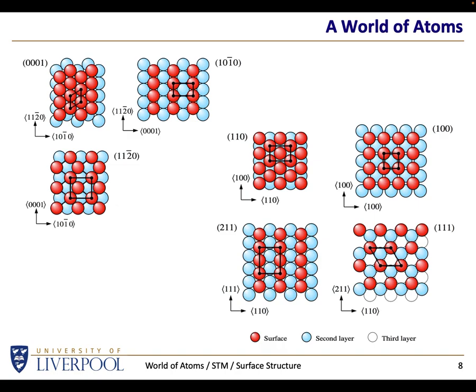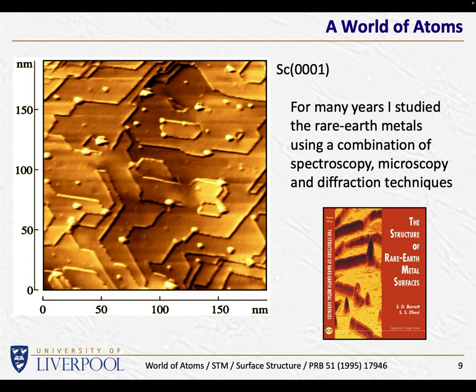So I started studying how the atoms are arranged in particular crystals of these various metals. There were 14 of them in the periodic table. So I spent time with scanning microscopes as well as other techniques trying to investigate how these atoms are arranged. And these are the sorts of models, if you like, that you can determine when you've got atomic resolution in your microscopes.